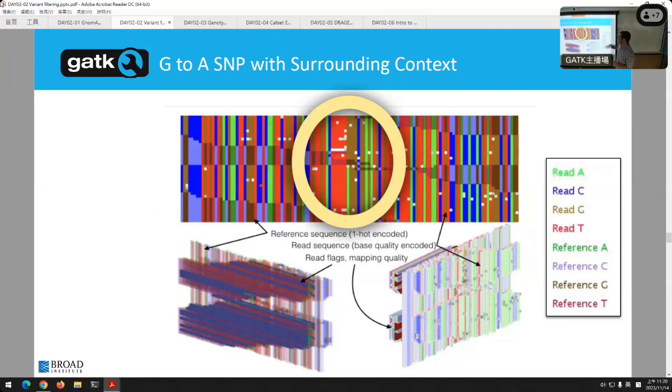So it's a G to A. G in IGV, we've used the same colors as IGV. G is brown and A is green. So look over here, right in the middle. I don't know if you can see them online. Right at this position here, there's brown and A. And you see a SNP right here. It has learned from the data, from the features, that there is a SNP in this position in the genome based on the reads.